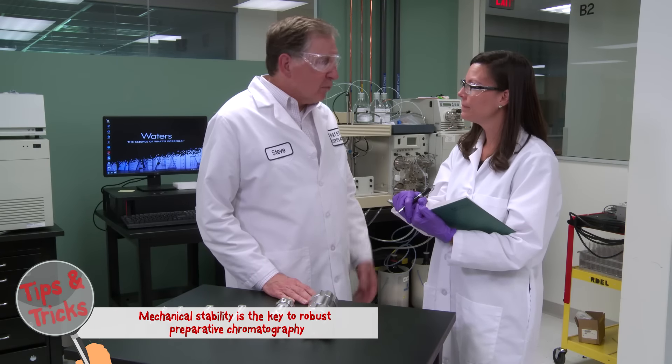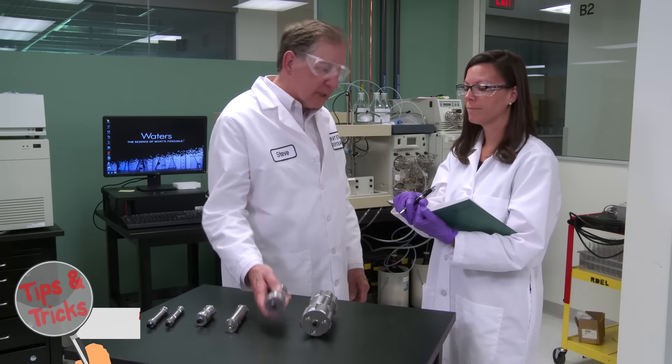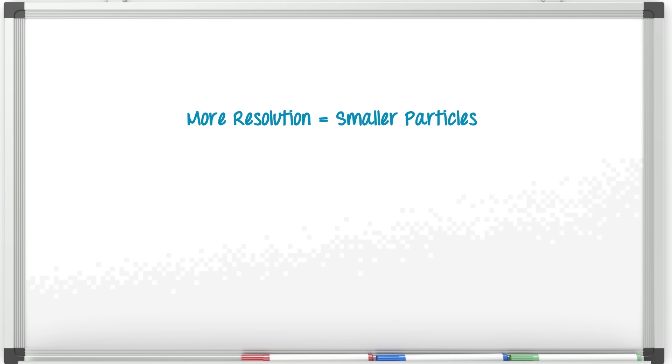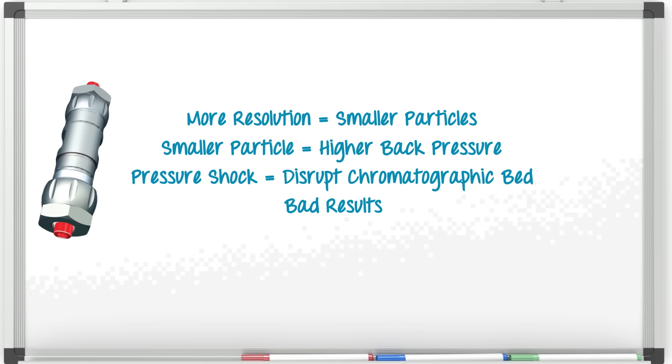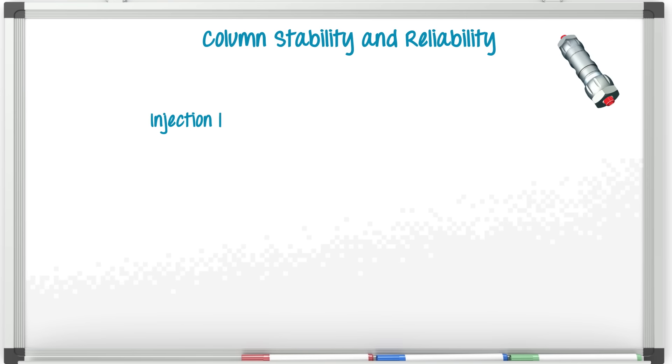Actually, this is preventable. We need good mechanical stability. Typically users are looking for more resolution. As a result, prep columns are being packed with smaller particles. Smaller particles have higher back pressures and more compressive forces during a preparative run. These forces, such as the pressure shock of viscous samples, can disrupt the chromatographic bed of the column. Waters' column hardware technology is critical in extending the column life, but the results are in the data. Let me show you.